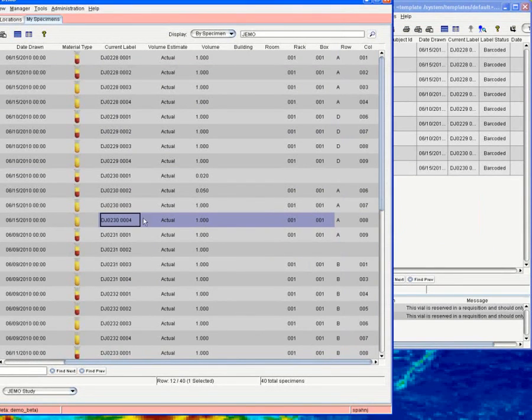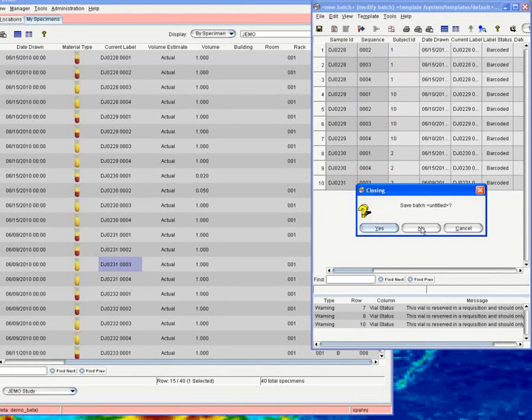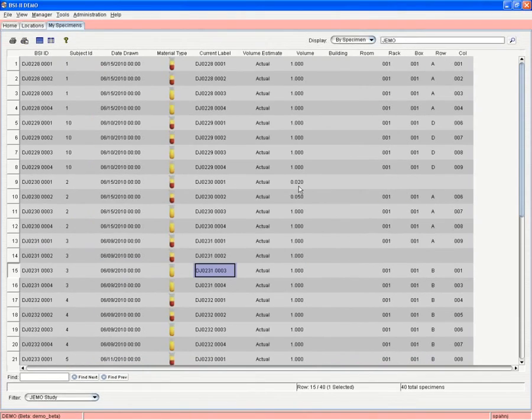You can click and drag records into tables now. So let's do it again. I'll click from here, hold down, and then drag it into the mod batch. So I can add specimens to my mod batch that way. I'm going to go ahead and close this mod batch and open up My Specimens again. Go back to the right mouse button menu.